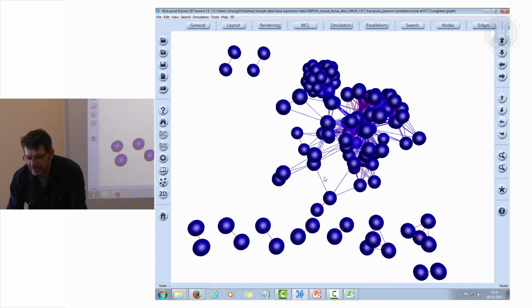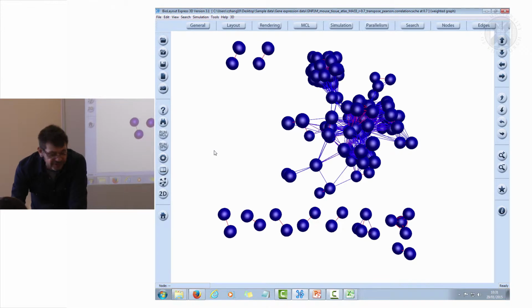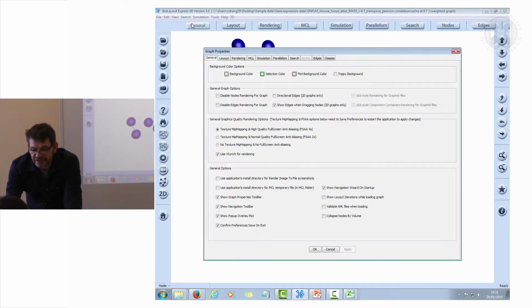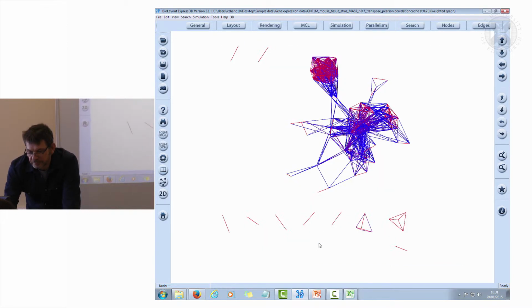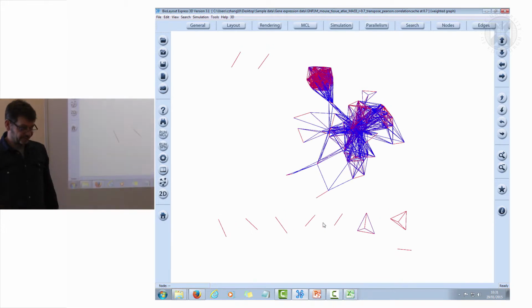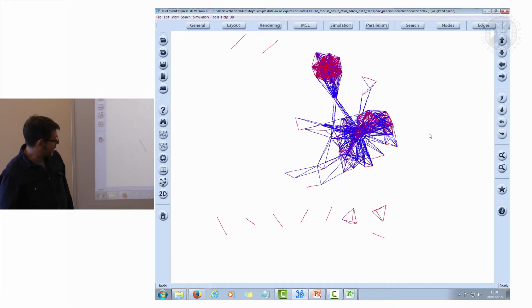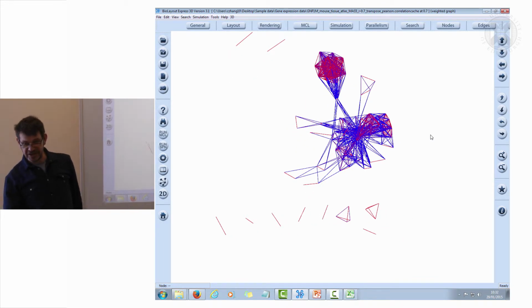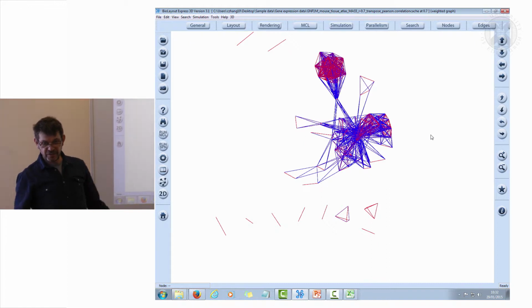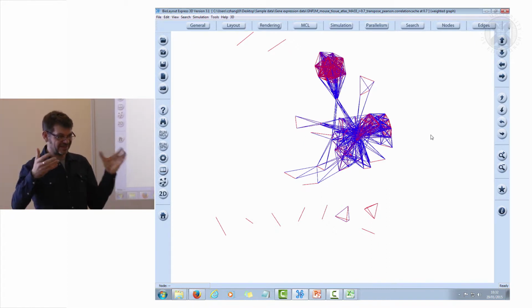Now, we're going to go into the first basic thing with this, and this is clustering. I'll try and show this by disabling the nodes. You can see that this graph has structure. We've got a series of things that share relationships with each other, and those relationships are not some sort of random relationship matrix where everything is kind of related.